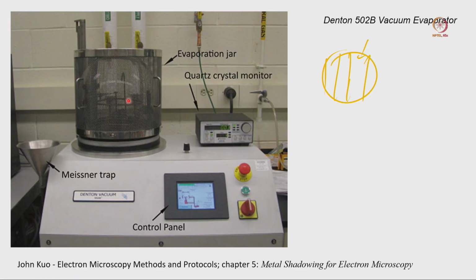This side will be black and this side will be white, and you can see this molecule very clearly. For biological samples, especially protein or bacteria or viruses, that is not that important, but for DNA, where there is only a very thin thread, if there is a deposition and a contrast difference between both sides, the DNA will be clearly visible. That is the reason most of the time we use metal shadowing to visualize DNA. Now, come back to this slide again.